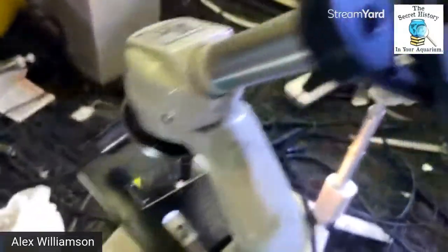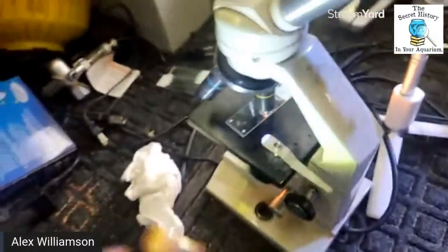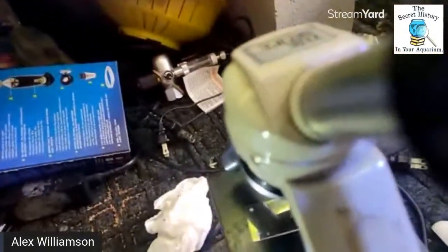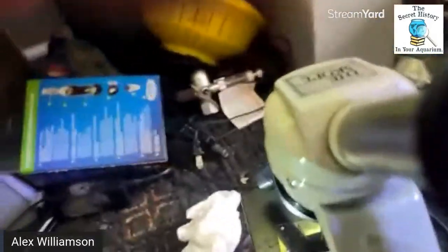And this is the rig we're using, by the way. I got a bunch of electrical cords and extensions because of the various lights and LEDs it takes to illuminate the stage. You can't just use the one that came with the camera. It doesn't like that. Look at all of the beautiful duckweed bracelets I have.